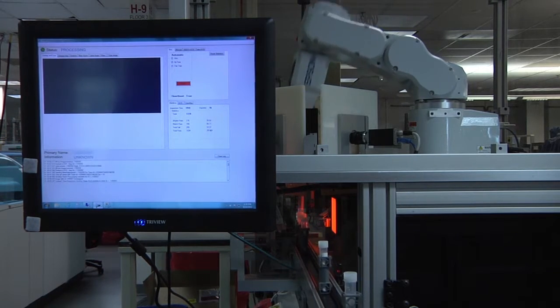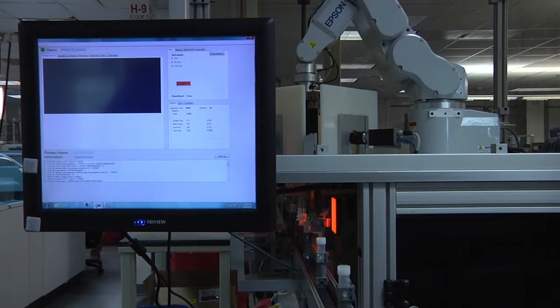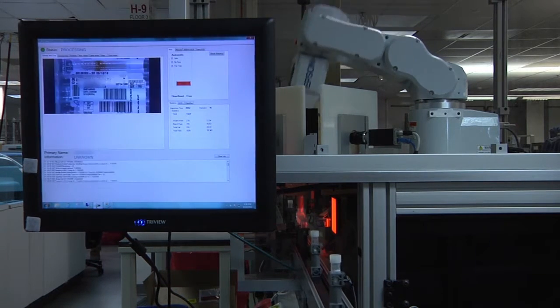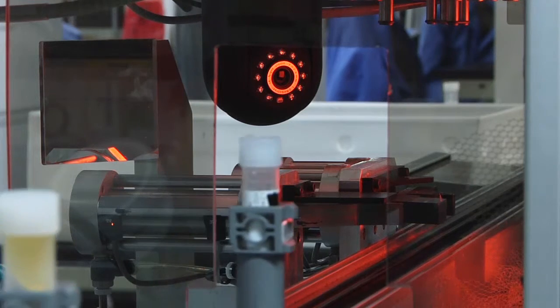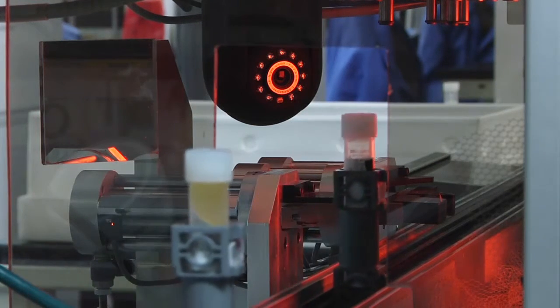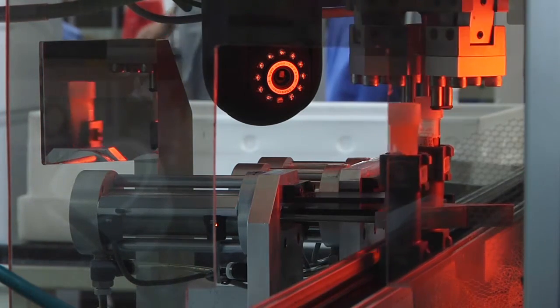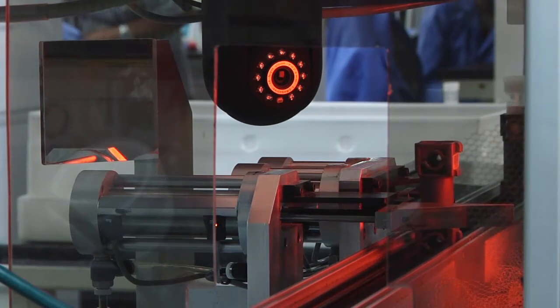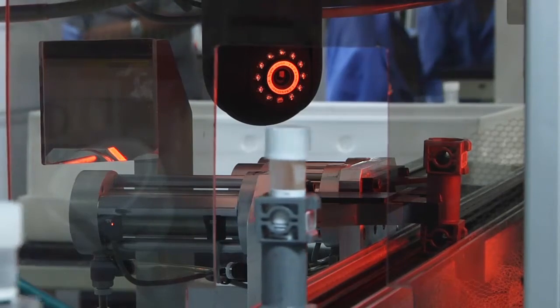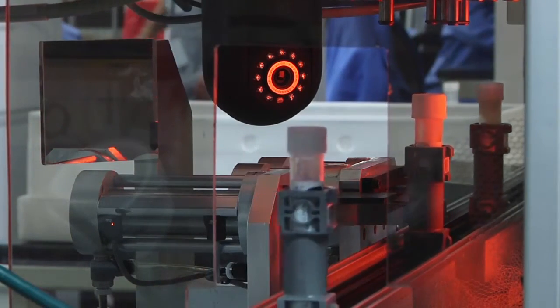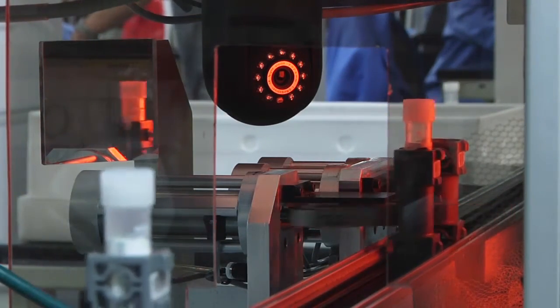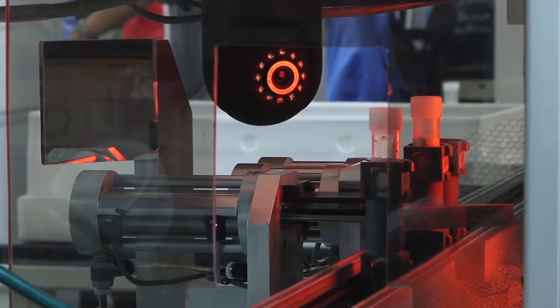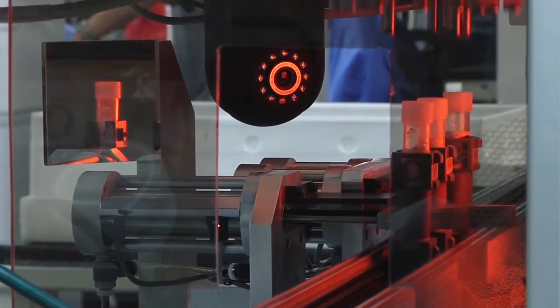The cycle time for one tube ranges from 2.5 to 3.5 seconds, depending on the quality of the label. This view again shows the transport carriers with tubes arriving at the stopping point where the robot will lift them to the vision system. On the left, you can see the 45 degree mirror that the smart camera uses to measure the tube's dimensions to guide the robot in correctly picking up the tube by its cap.